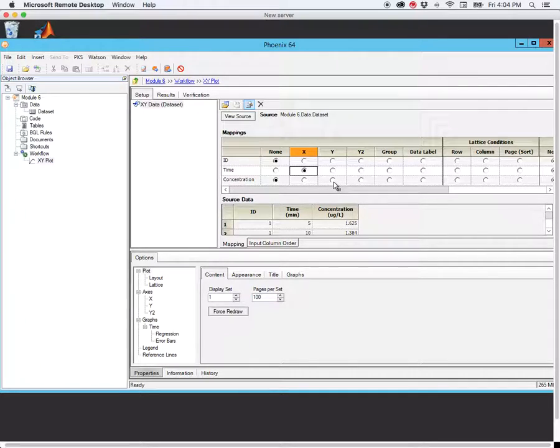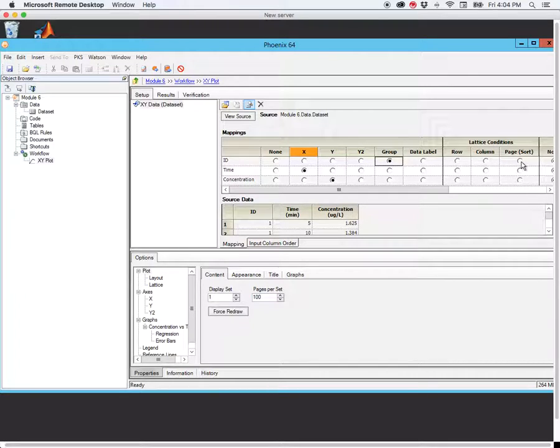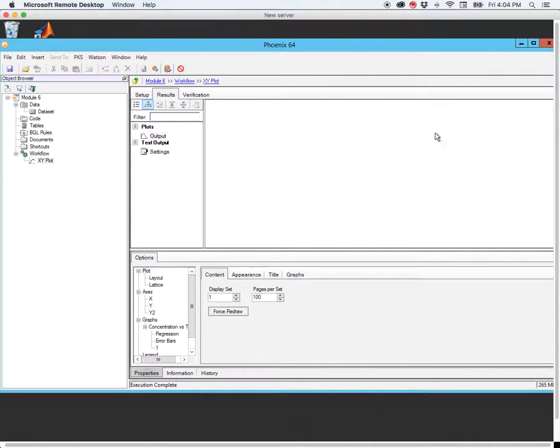Time is always X, concentration is Y. We have ID because we only have one animal, so it doesn't really matter what we do with ID. But if we had numerous animals, we may want to use ID as a group variable or as a page sort variable. A group variable will plot all the data on one graph but the different animals will have different colors. Page sort will plot the data for each individual animal on a separate page. So let's run this.